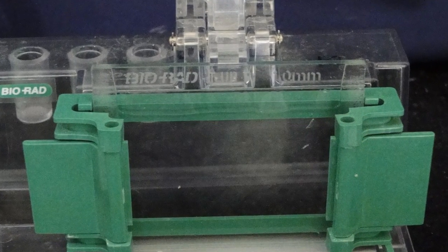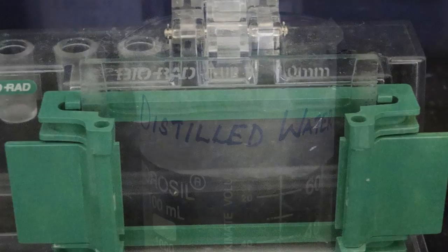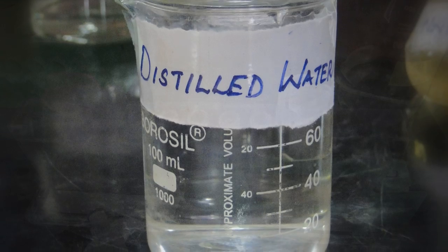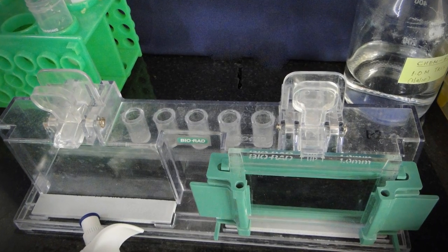It is okay if you introduce air bubbles. Add a layer of isopropanol or distilled water on top of the gel to level the poured gel. Allow the gel to polymerize for 20–30 minutes.